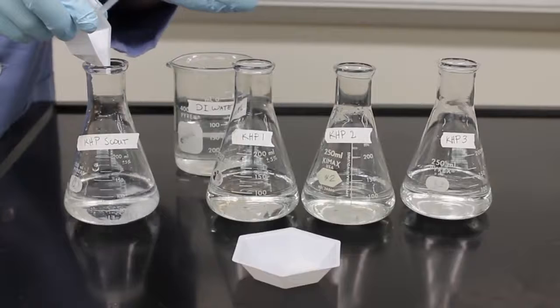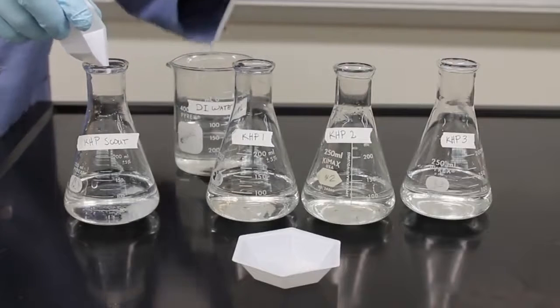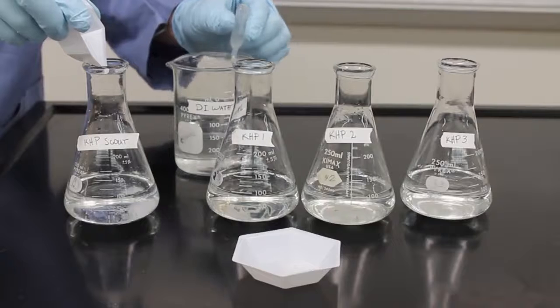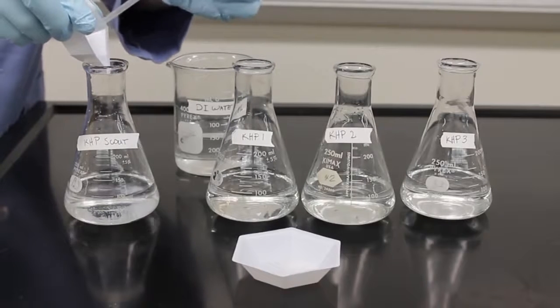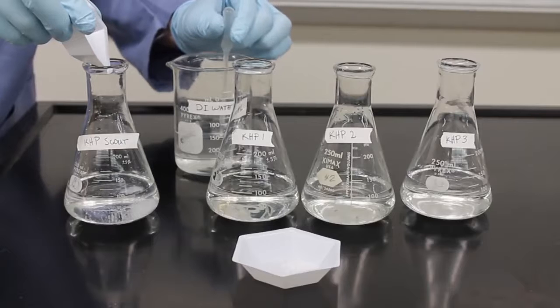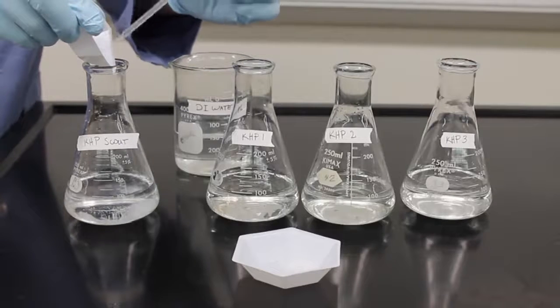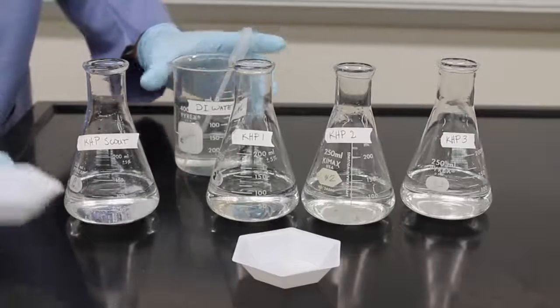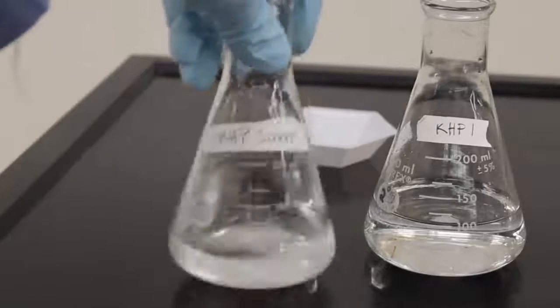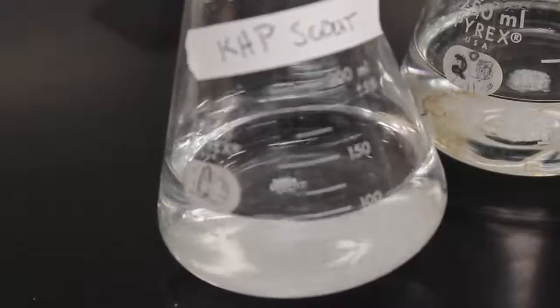This technique is called a quantitative transfer. Another technique that you could use is called massing by difference. See the description below for a link to the balance video for this technique. KHP may take a while to dissolve, but it is important to make sure it is fully dissolved before you start your titrations.